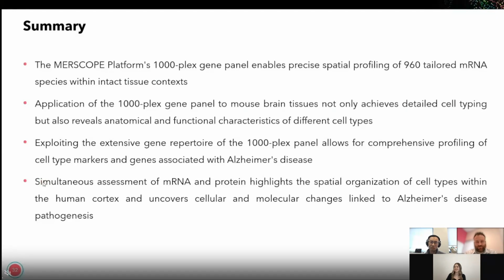Wonderful, thank you. All right, next question asks, can you design a way to identify or mark the region we could apply on the MERSCOPE slide? Yeah, so I can take that question. We're actually getting ready to launch a solution around that. It'll be a sample placement guide that you will attach to the bottom of the MERSCOPE slides. This will allow you to visualize where that imageable area is on the slide and more accurately place those tissue samples when you go to mount them.